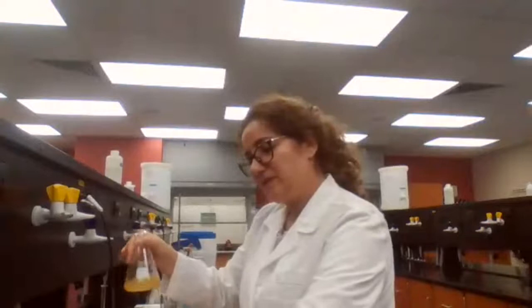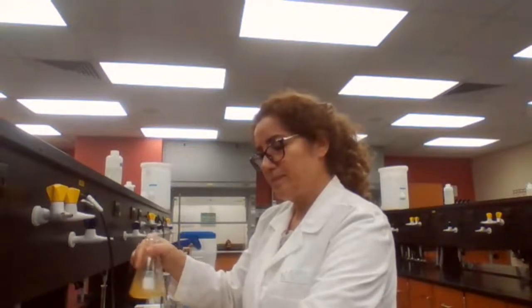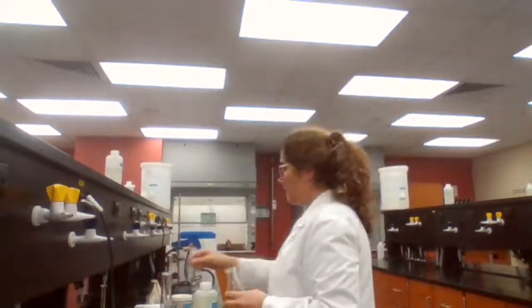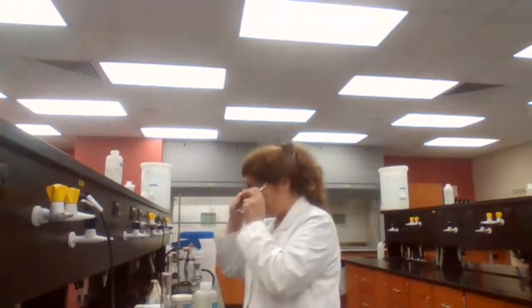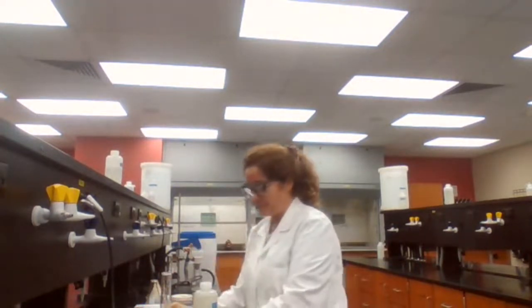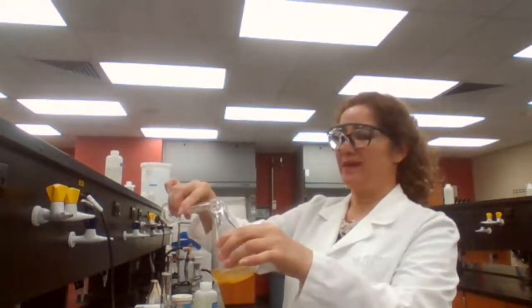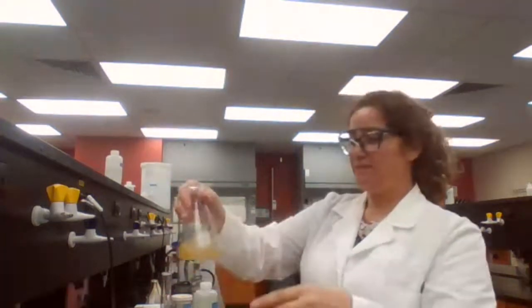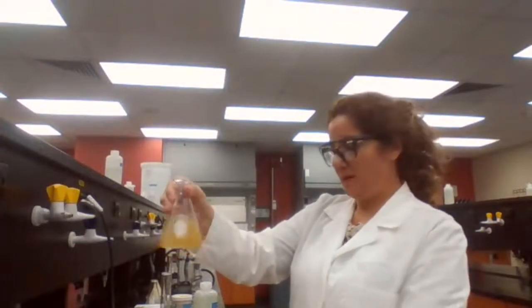Then we are adding the 5 milliliters of the acetic acid in small portions. So I'm going to add the acetic acid in small portions and mix it well.